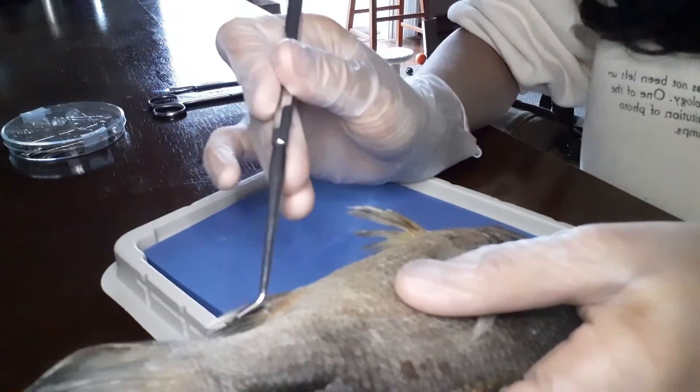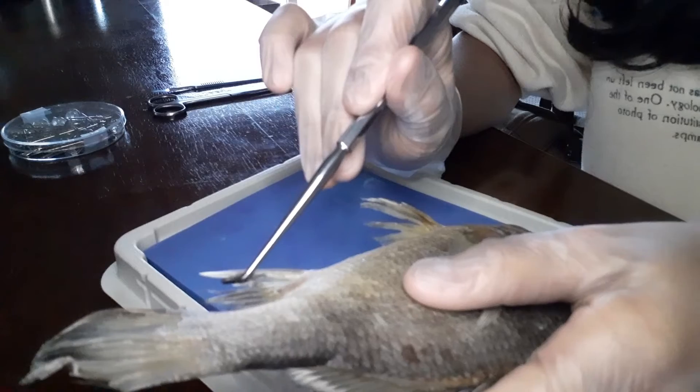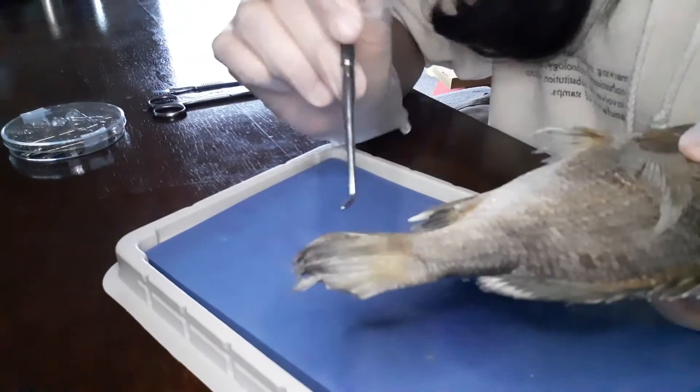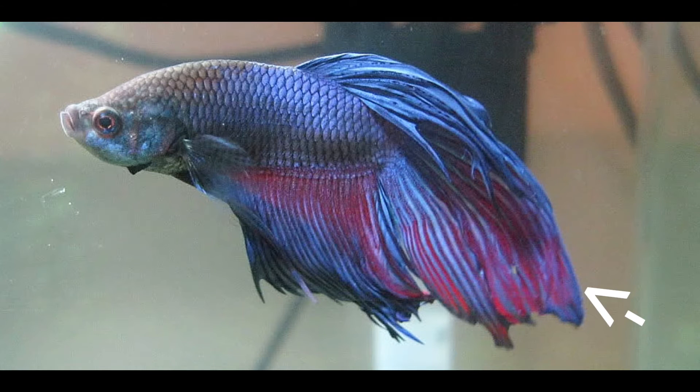Here is the anal fin. It helps stabilize the fish when roaming around underwater. Here is the caudal fin — it's the main source of movement for the fish. Here is an example of a caudal fin on a fighting fish. It's very pretty.